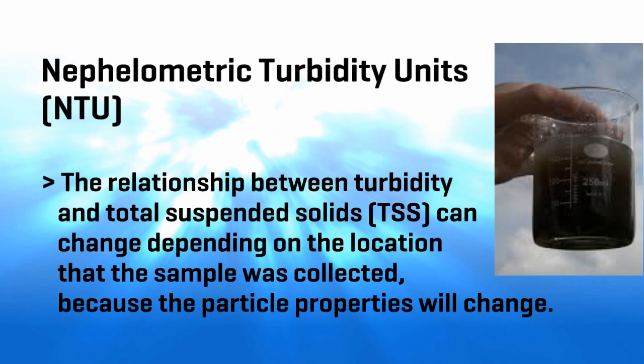Total suspended solids is really what we're talking about here. The solids that are suspended in the water, and it changes. Again, it's very dynamic. Things are going on all the time. So getting a good true turbidity reading can be a bit elusive.